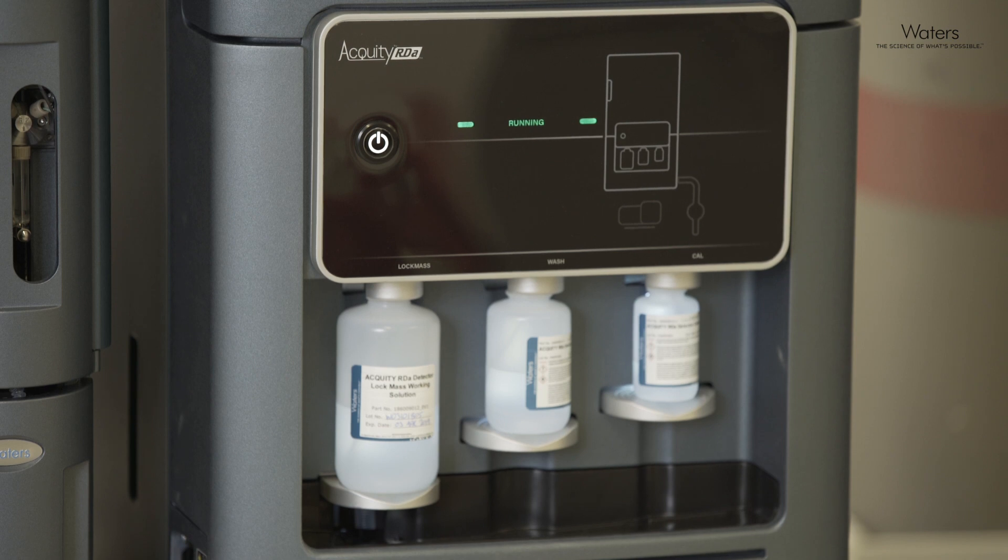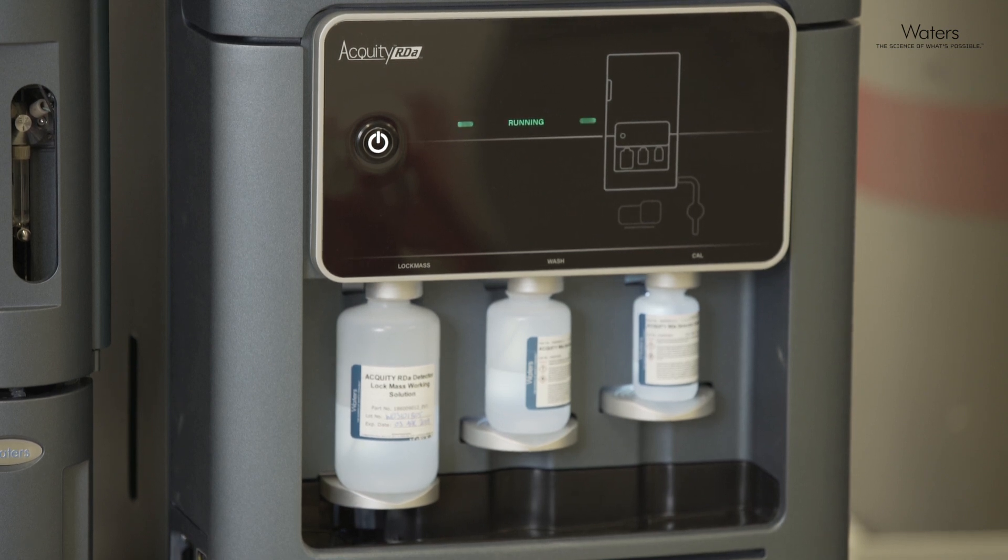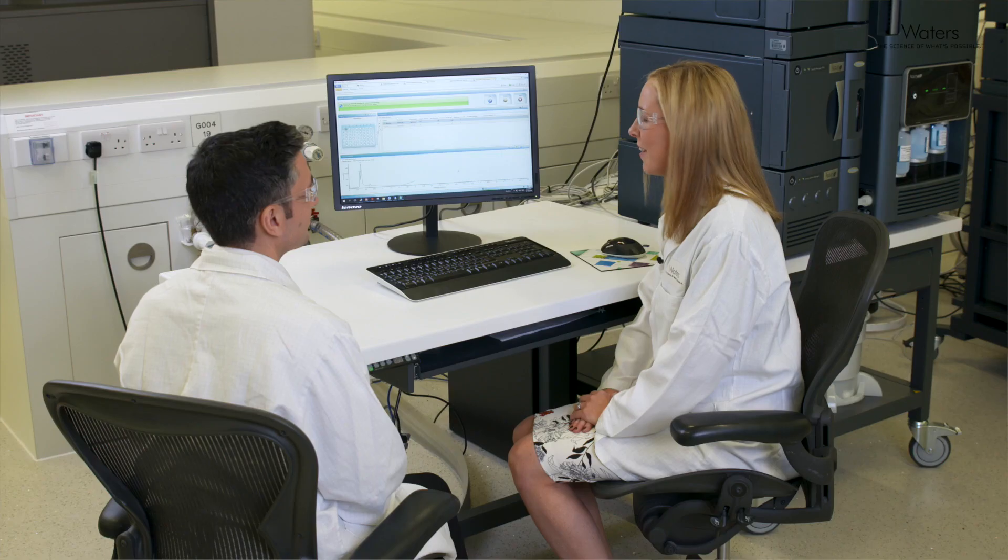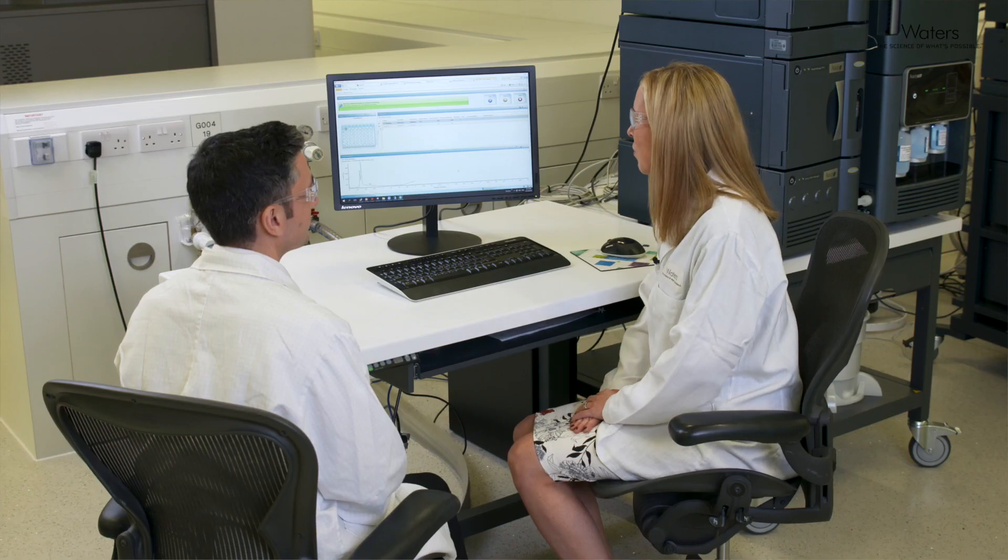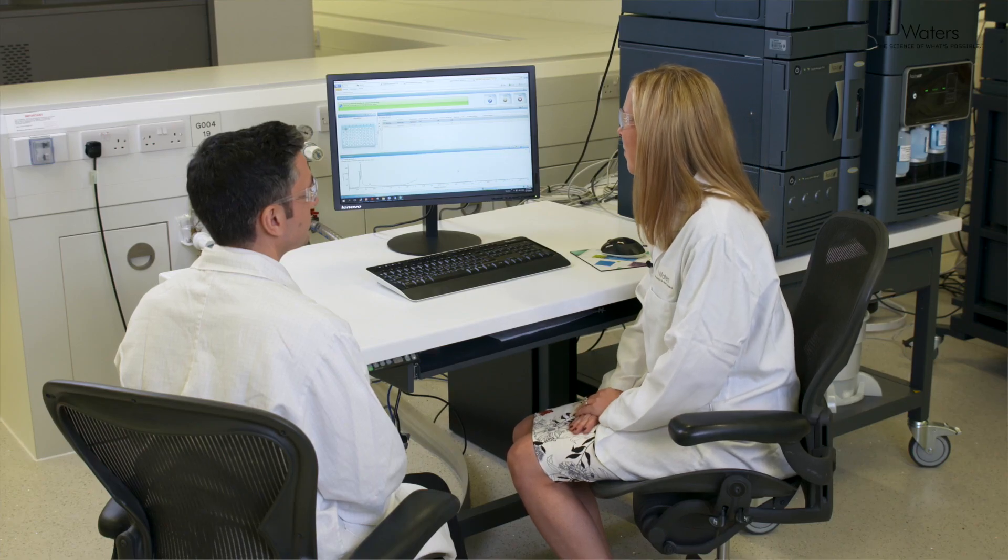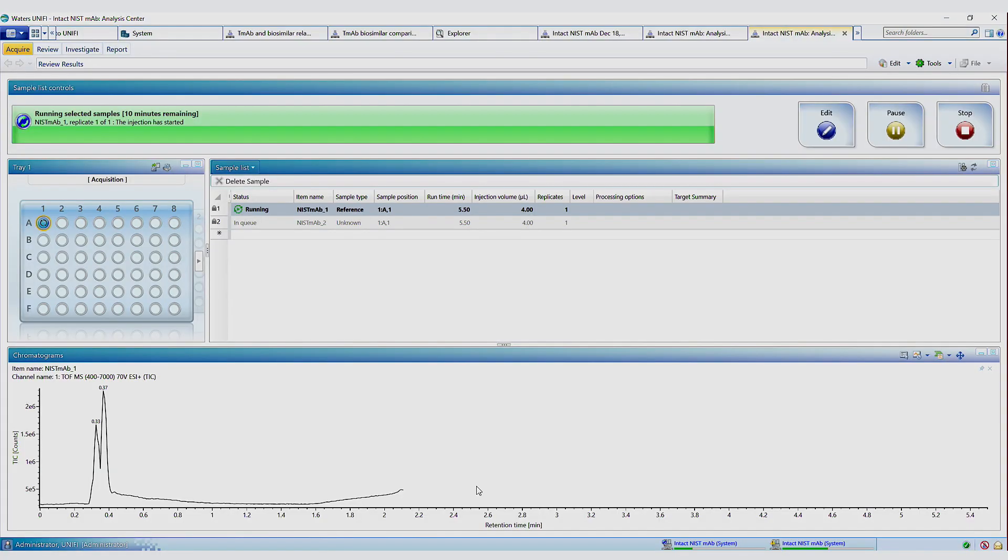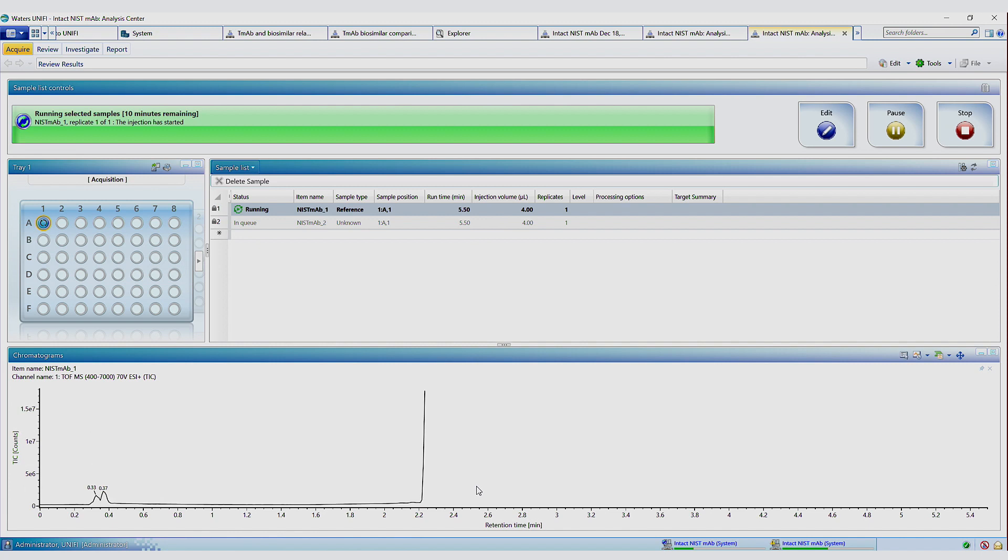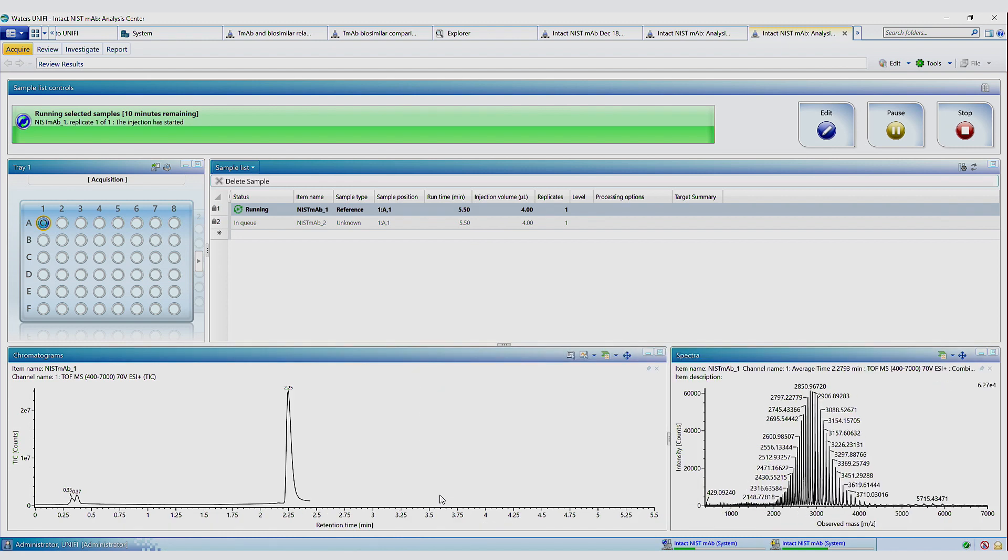So we're going to run samples. We're going to process the data and generate a report. So we're just looking at the real-time acquisition now. So we can see we've got the TIC trace up, and we're just waiting for the MAB peak to elute.